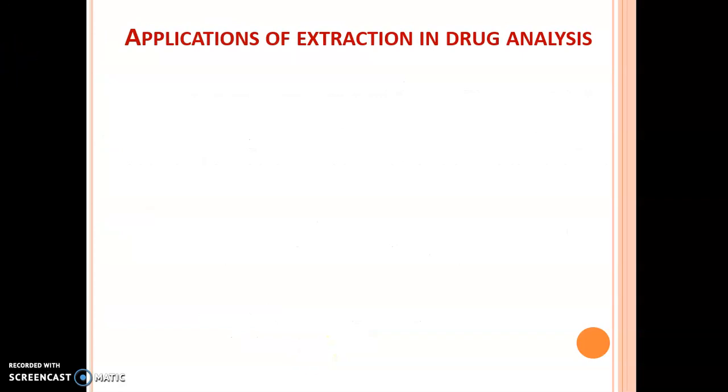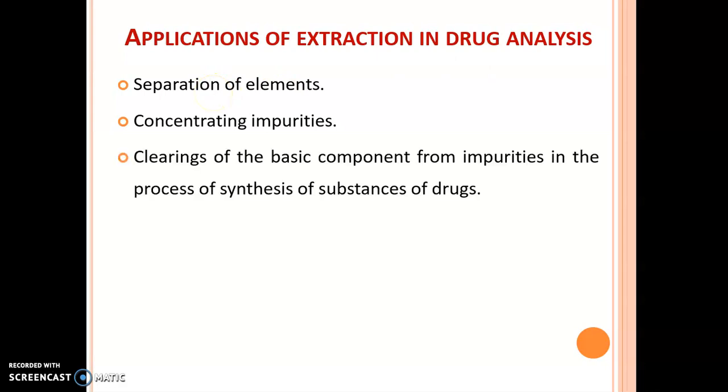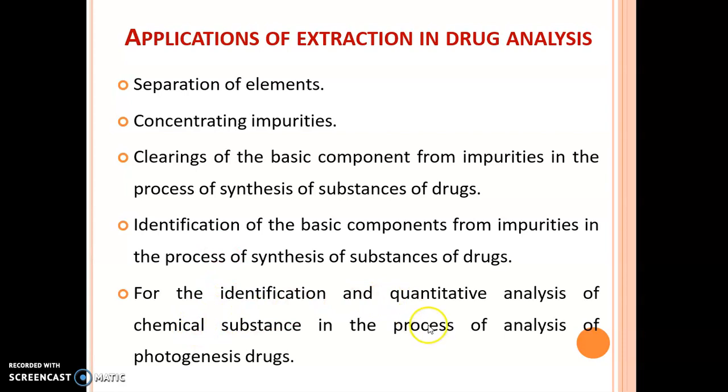So let us see the applications of extraction method in drug analysis. This method is applicable for the separation of elements, then for concentrating impurities. It is also used for cleaning of the basic components from impurity in the process of synthesis of drugs. It is also applicable for identification of basic components from impurities in the process of synthesis of the drugs.